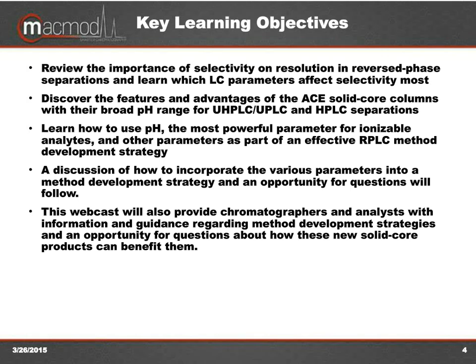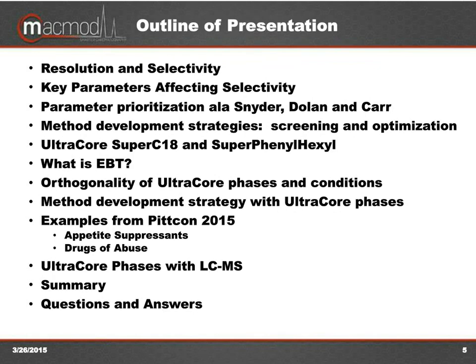Here's an outline of today's presentation. We'll start with a brief review of resolution and selectivity. We'll examine some of the key factors affecting selectivity. I'll show a slide on how the various parameters that affect selectivity are prioritized, from work done by Lloyd Snyder, John Dolan, and Peter Carr.